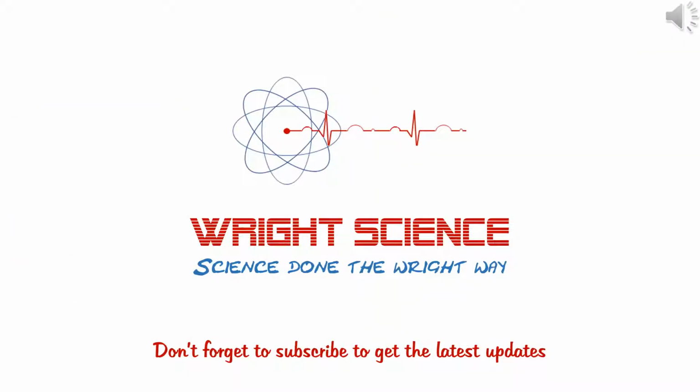Hopefully at the end of this video we can now describe the process of simple distillation and fractional distillation and what we could use them to separate.